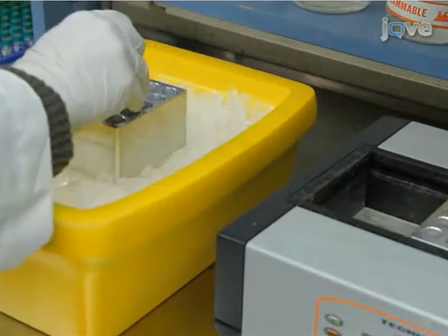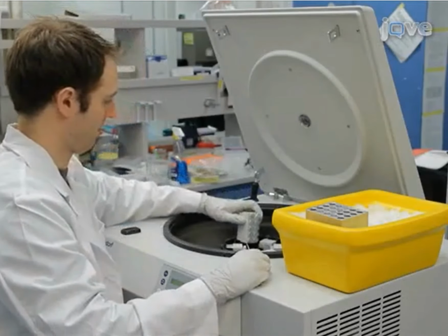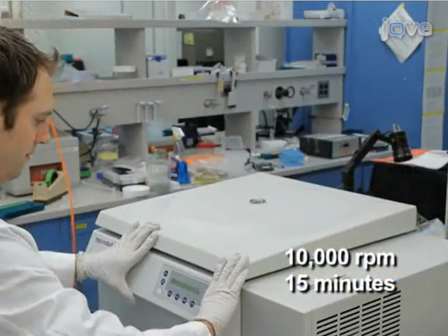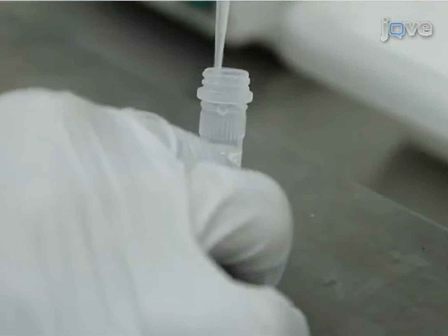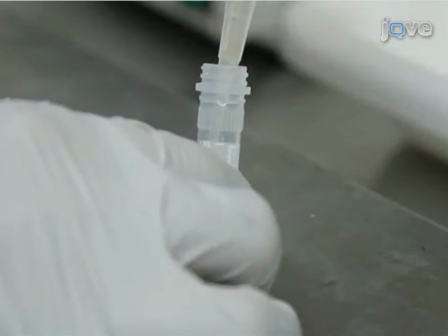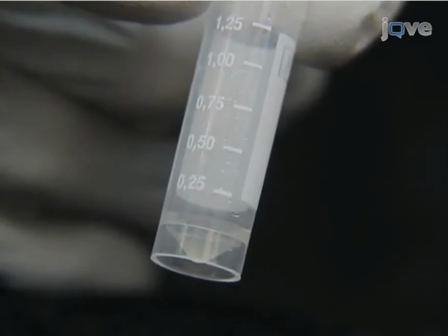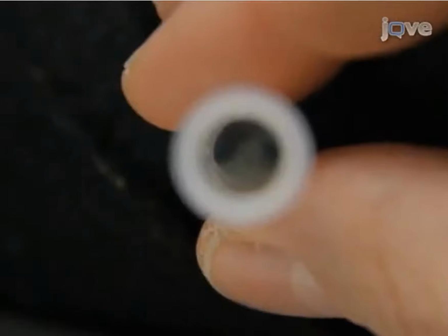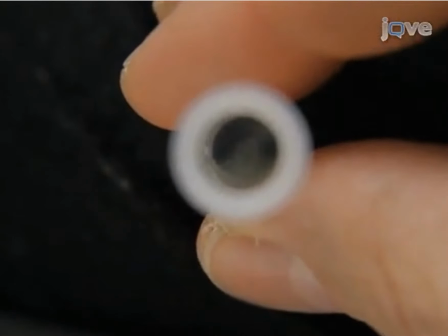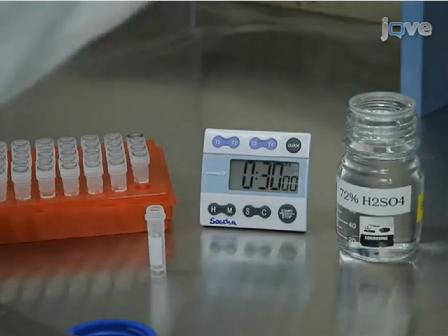Cool samples in the block on ice to room temperature or cooler, then centrifuge the samples at 10,000 RPM for 15 minutes. After centrifugation, discard the supernatant, ensuring that the pellet is not disturbed and no material from the pellet is removed. For this purpose, leave approximately 150 microliters of the supernatant in the tube. Wash the pellet several times with water.